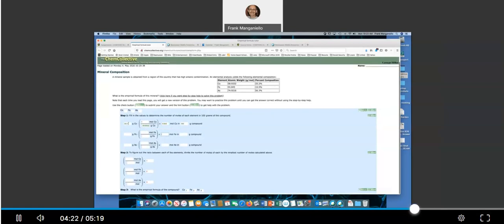So if this is the lowest of the three values here, and then watch your significant numbers. There's three significant numbers. So it would be 3. Okay? Because there's three significant numbers here. Right? So if this is the lowest value, then I'm going to put this number down here for all three.